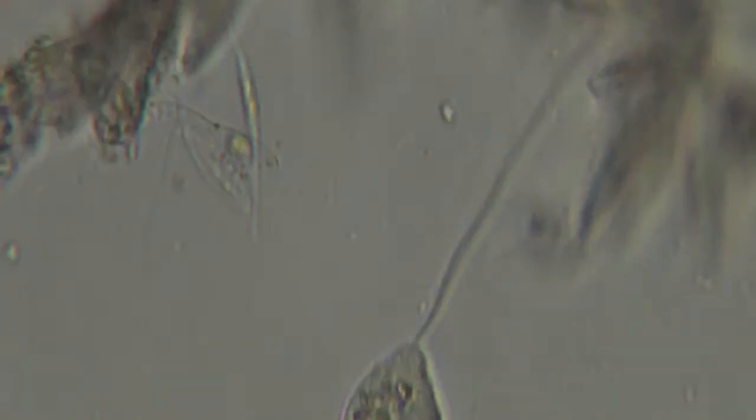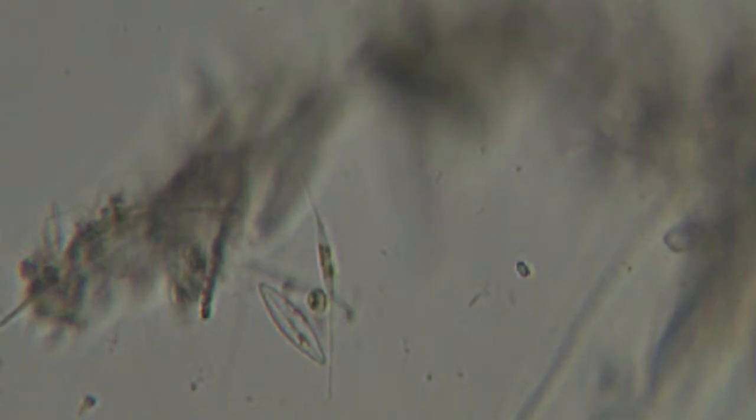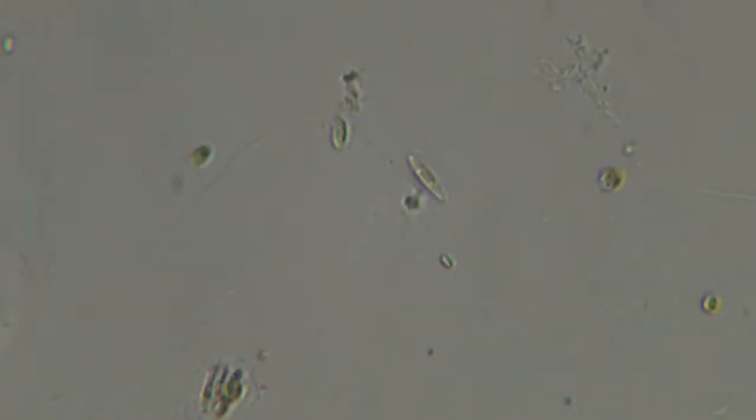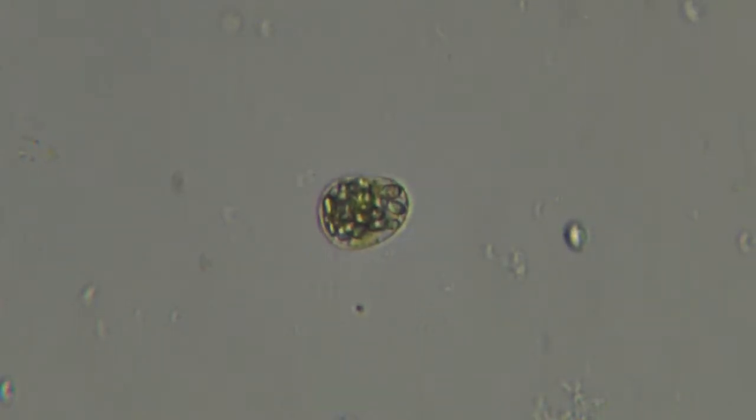Oh, there's a really nice tapered diatom there. Very delicate. See the long pointy ends? Right there moving in and out of the debris. Really nice. Couple other diatom shells in the area. All right. There's one of these little guys again, just hanging out. Chloroplast galore.